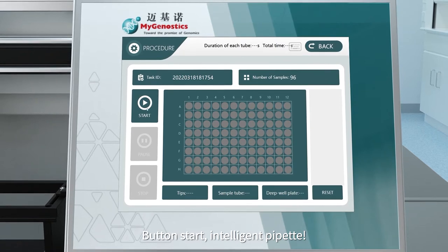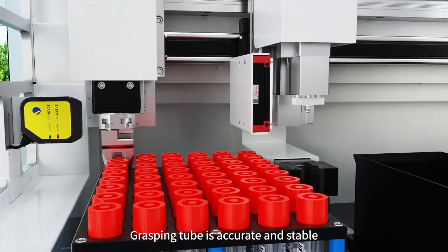Button start. Intelligent pipette. Grasping tube is accurate and stable.